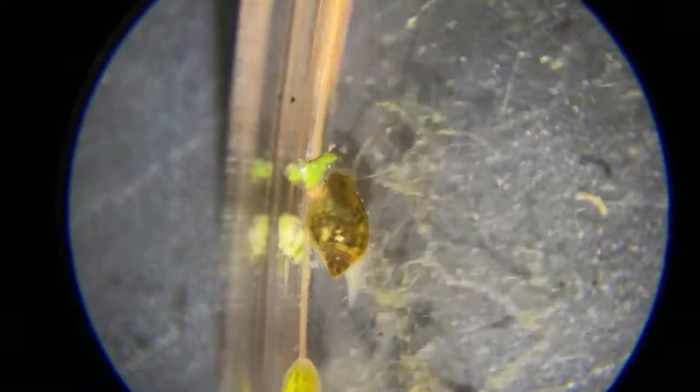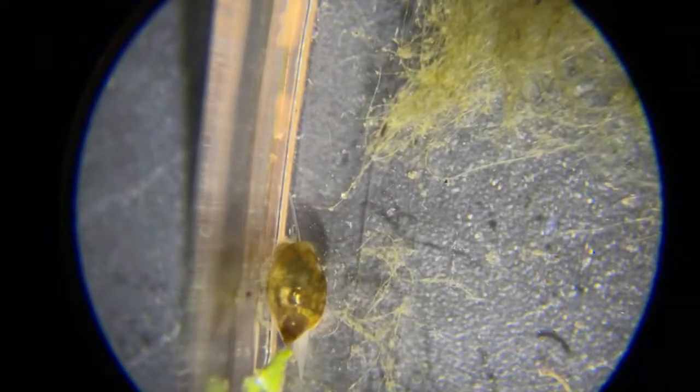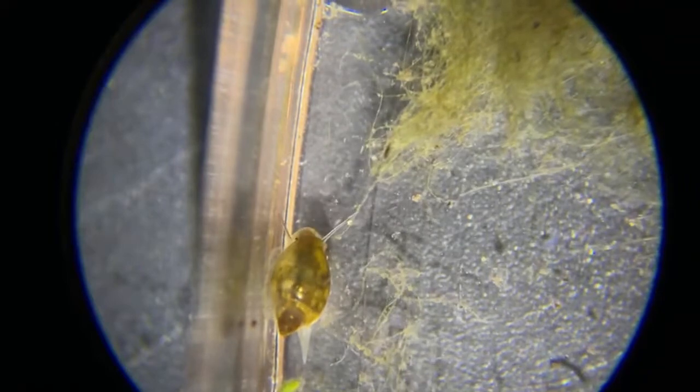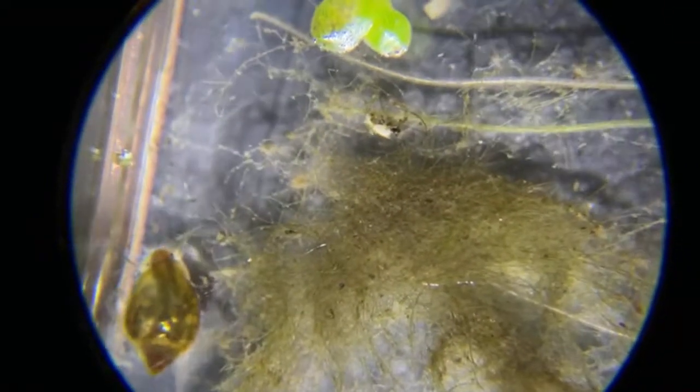And there's a little, I don't know what that is. I think that must be an insect swimming around. And I do have some algae in here. But what's pretty nice about this, I put a drop of water from another container, and you could see those white things. Those are paramecium. So that's pretty cool to look at, of how small those really are.